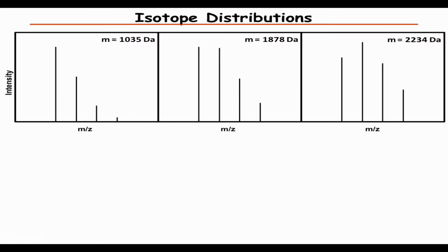So then we have the isotope distribution, as I mentioned before. We don't only have carbon-12, nitrogen-14, and hydrogen in nature, but we have 1% carbon-13, and of the other higher isotopes, we have also a little bit. What happens is that as your peptide becomes larger, there is a larger chance that you have a few higher isotopes.